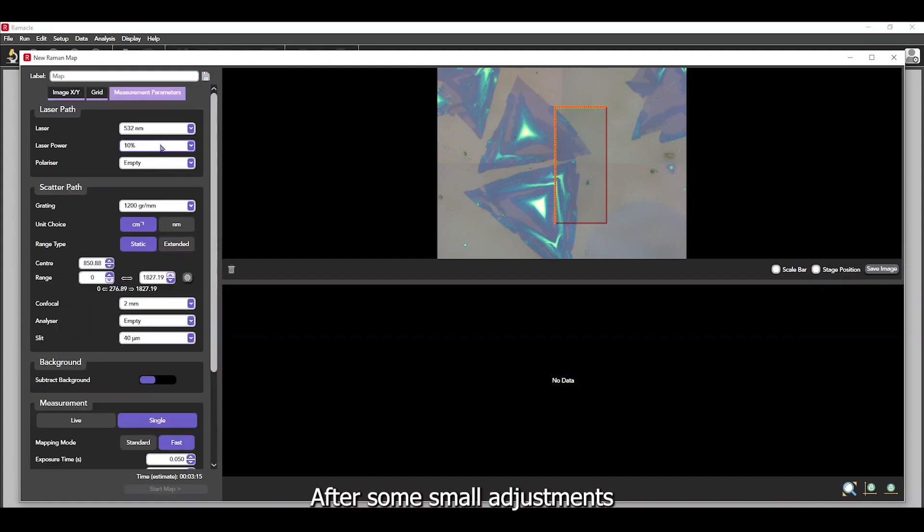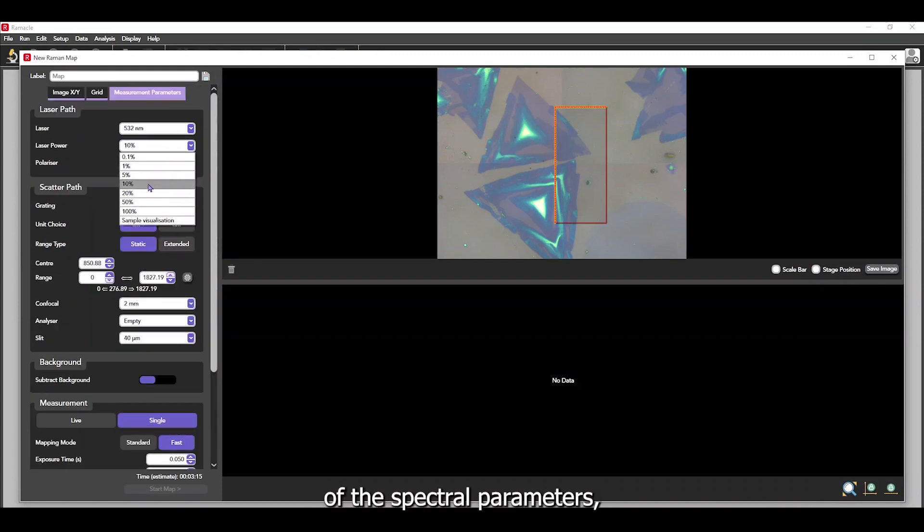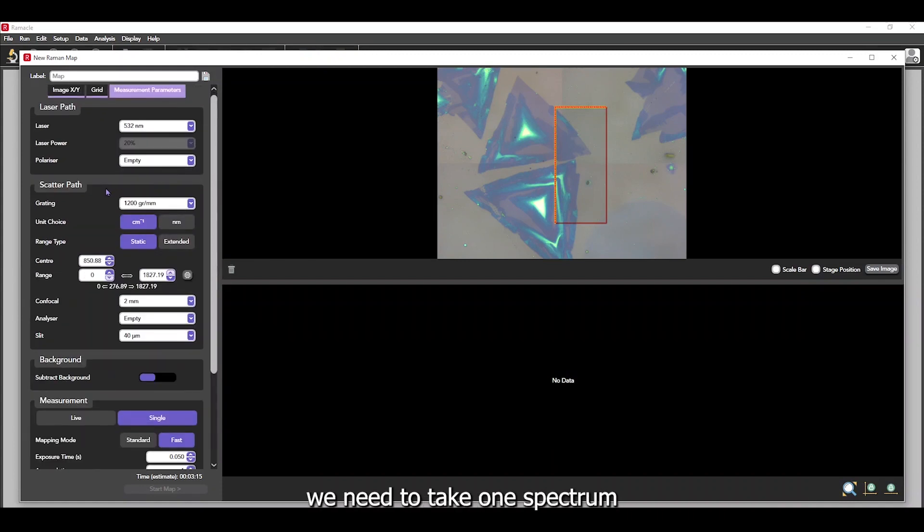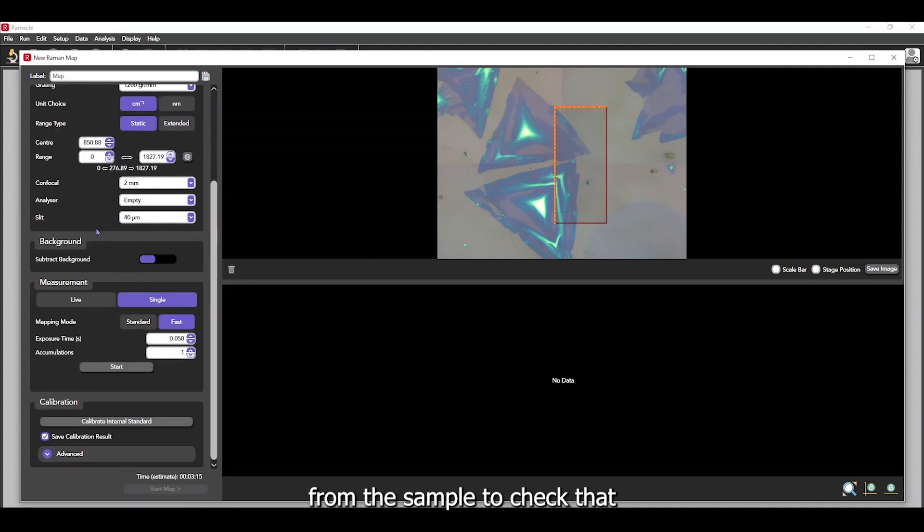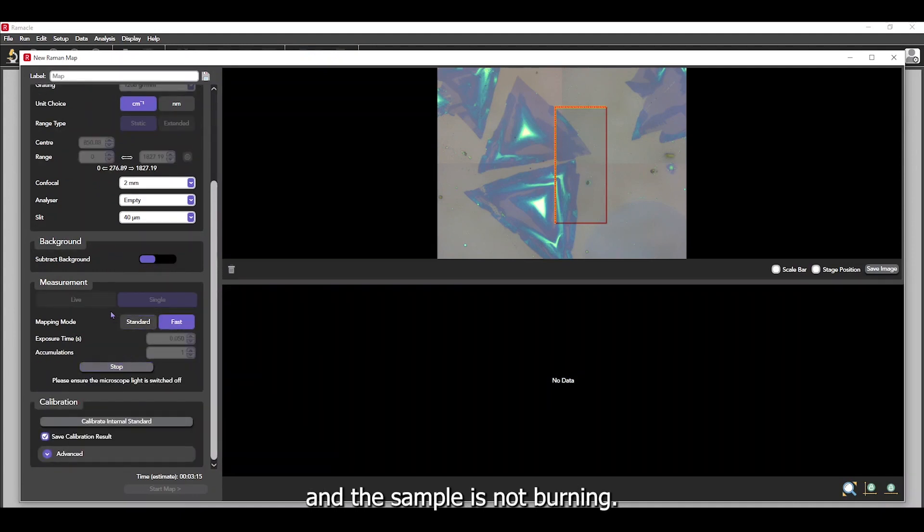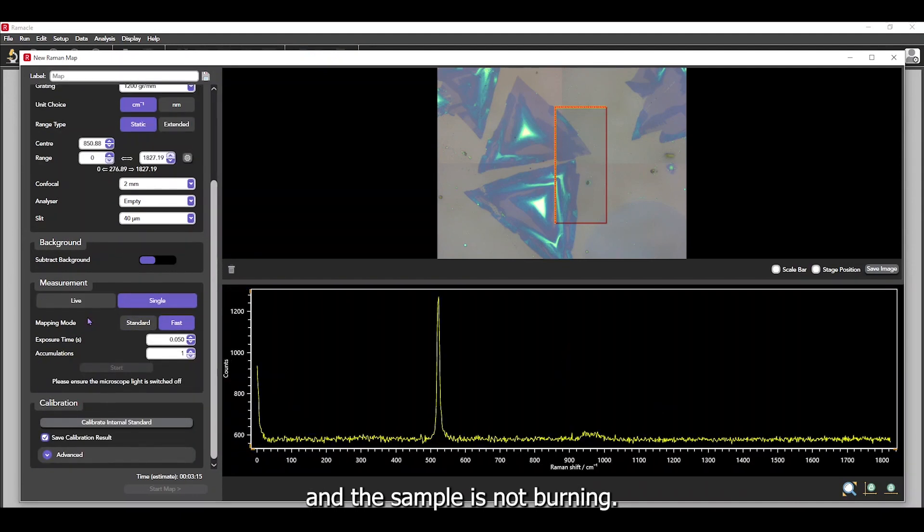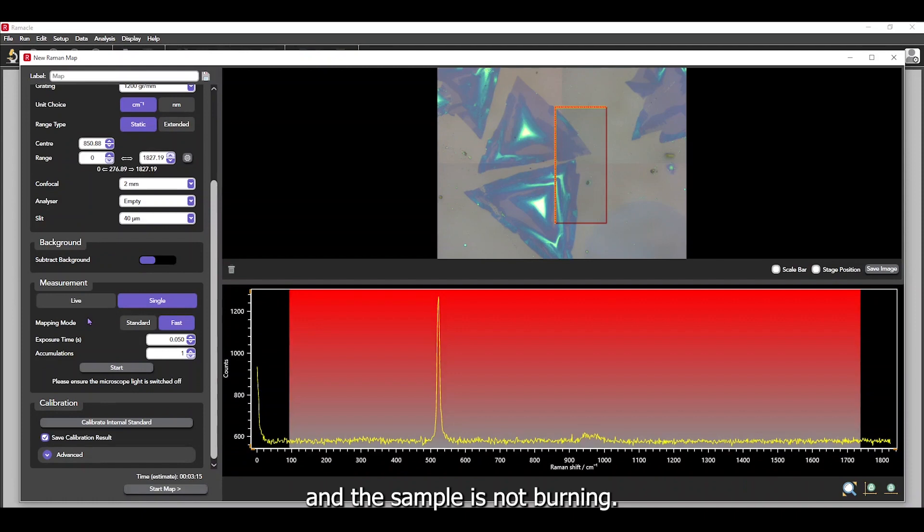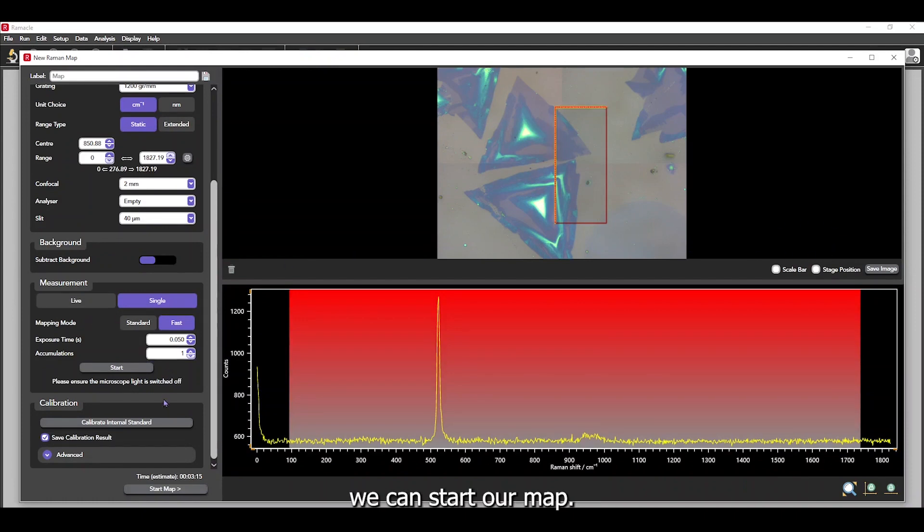After some small adjustments of the spectral parameters, we need to take one spectrum from the sample to check that the detector is not saturating and the sample is not burning. Once this is done, we can start our map.